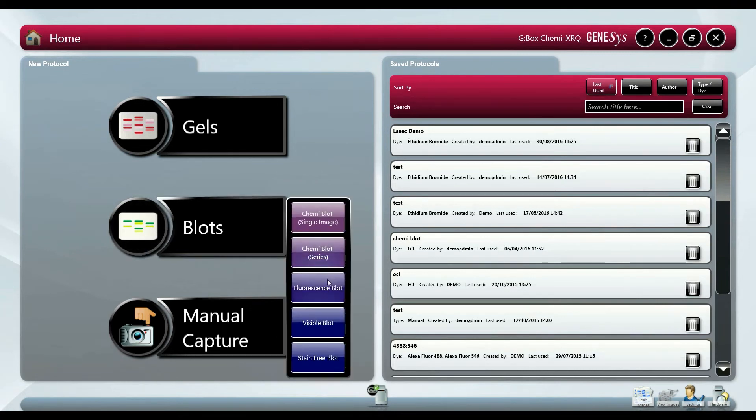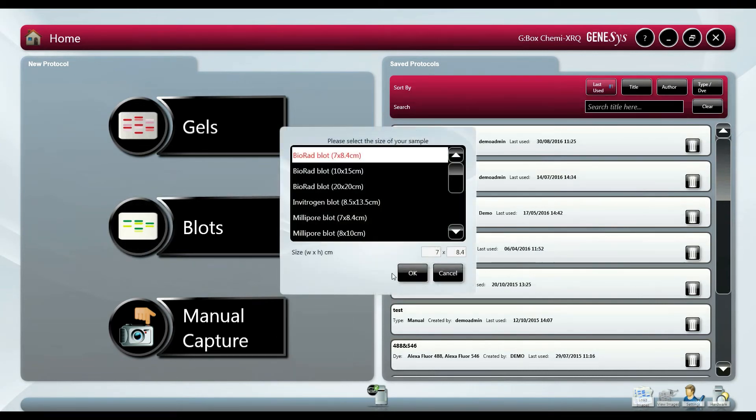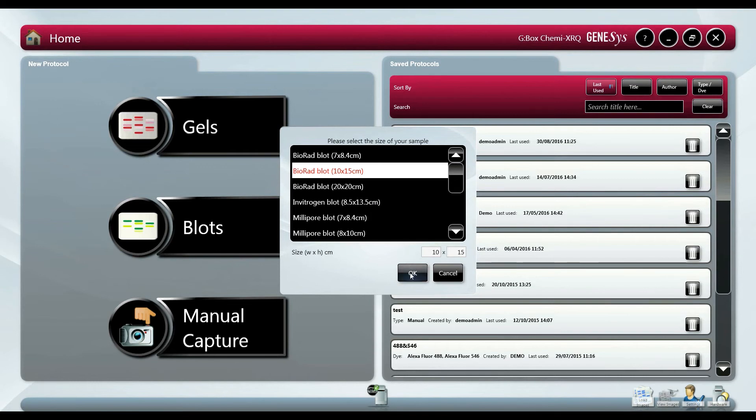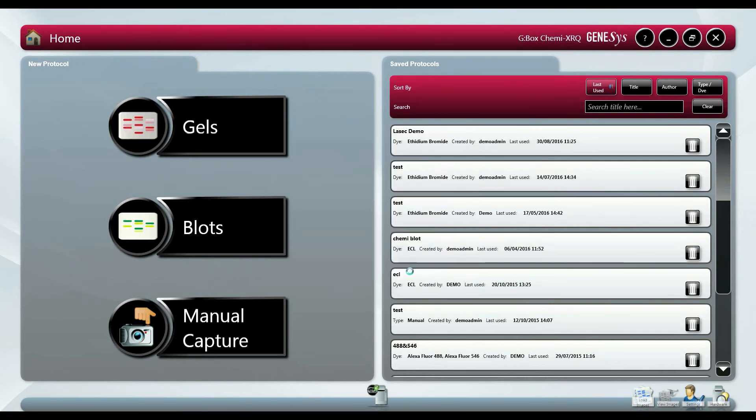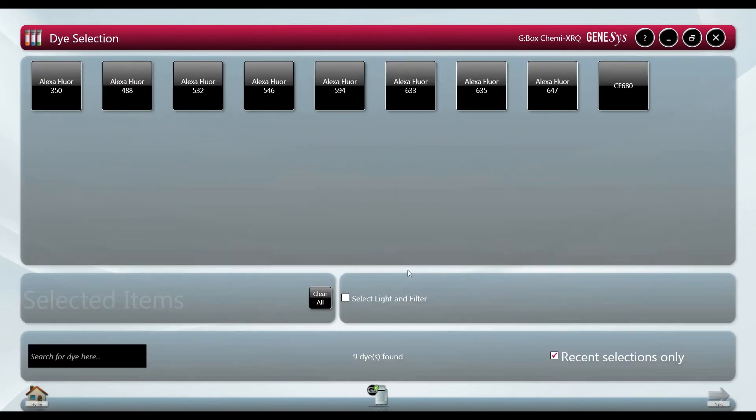Once we select fluorescence blot we select the blot size to automatically zoom in on the sample and optimize the resolution. When selecting dyes we have the option to select up to five based on what we are imaging on the blot.